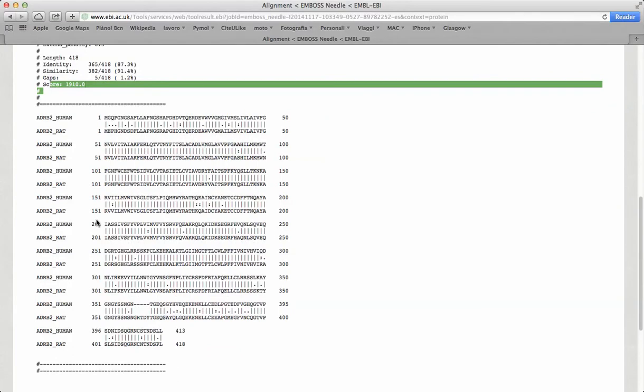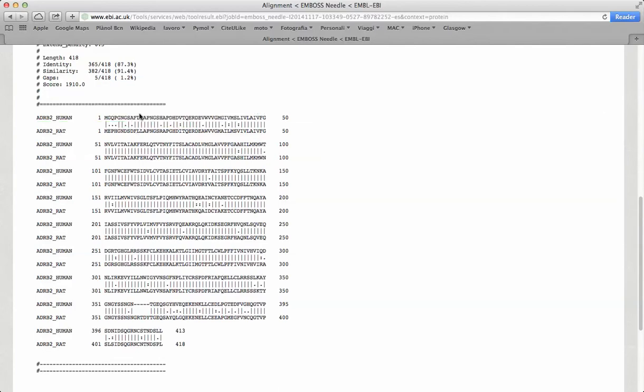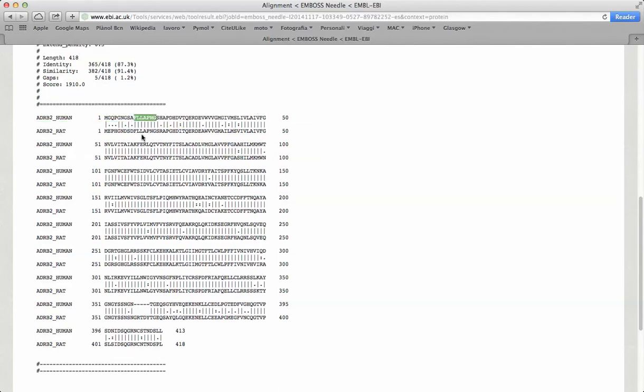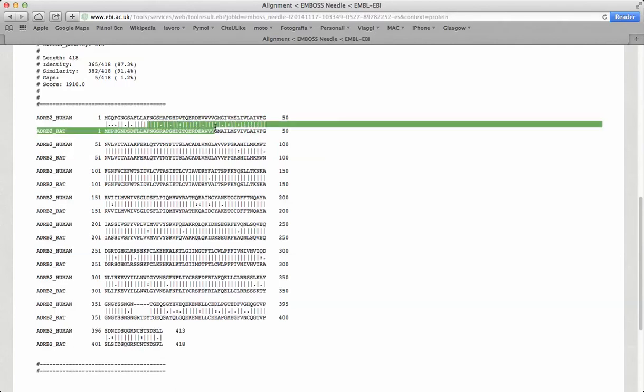The third part of the result is the alignment itself. It is composed of three lines. The first and the third represent the two sequences aligned. The second line represents the similarity between them.